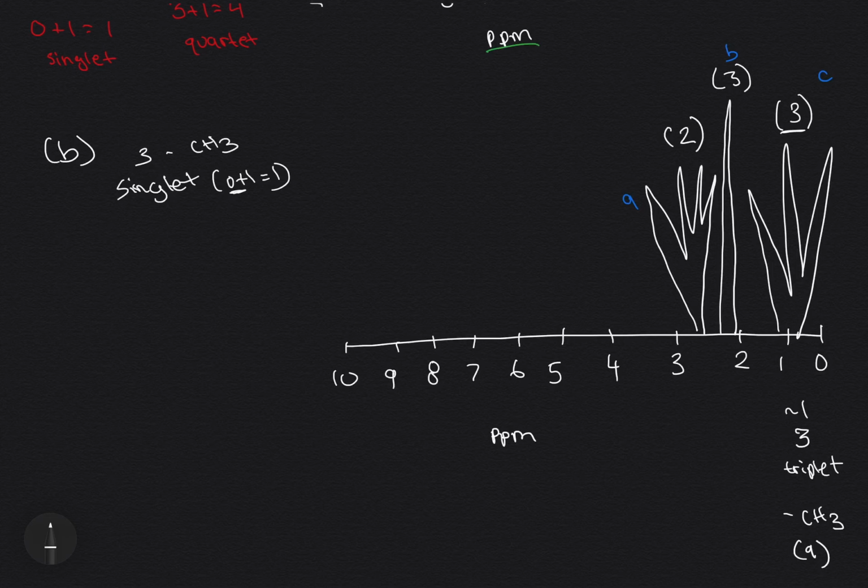But clearly it's not just next to another carbon, or else it would show up at approximately 1, as the same signal here. But anyways, and what else? The chemical shift. So we're at about 2, approximately 2 is our chemical shift. Okay, so like I said, we're thinking it's a CH3, just because we know there's 3 hydrogens on there.